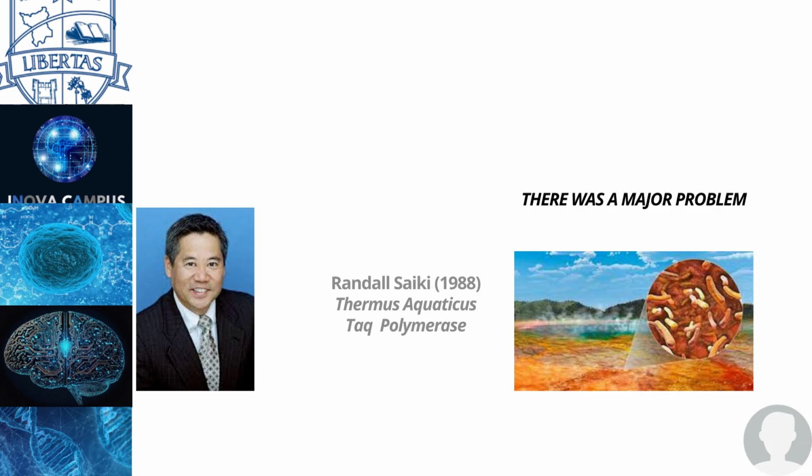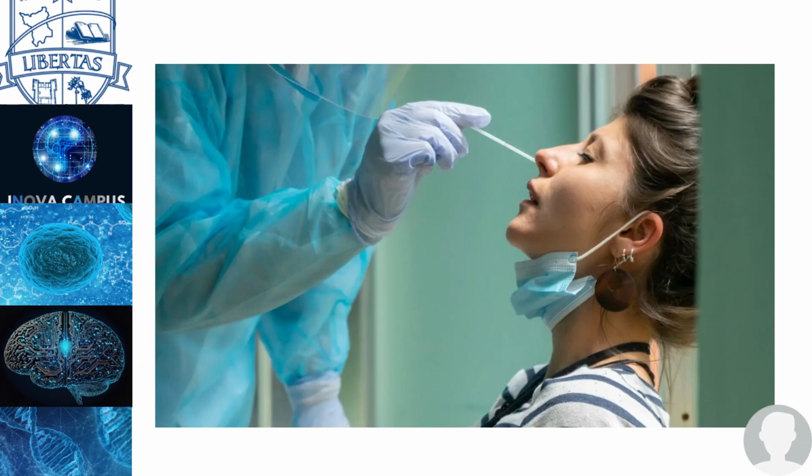So, with that, the PCR was invented and it started being largely and widely done around the world. And we could see that during the COVID pandemic that we had in 2019, 2020. We could see that because we would run a lot of PCR tests to see if people actually had COVID and in what phase of COVID people were.